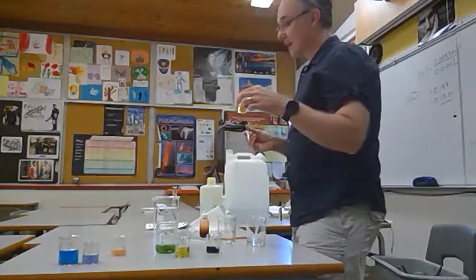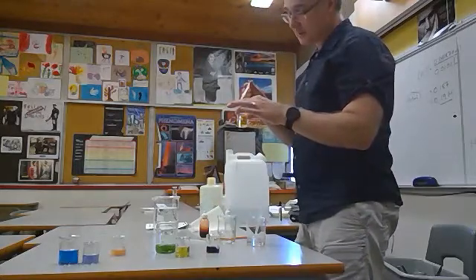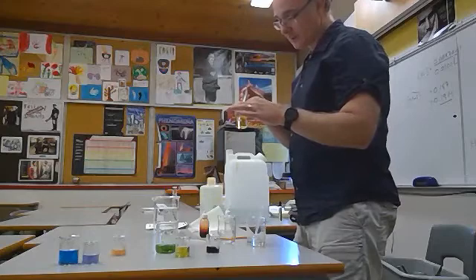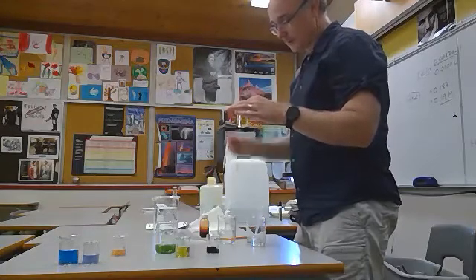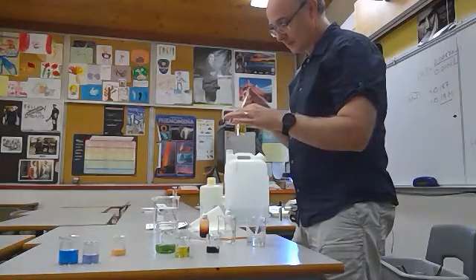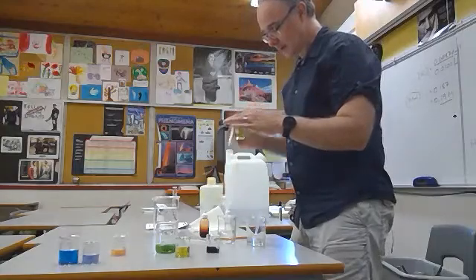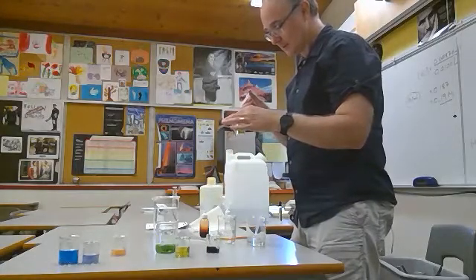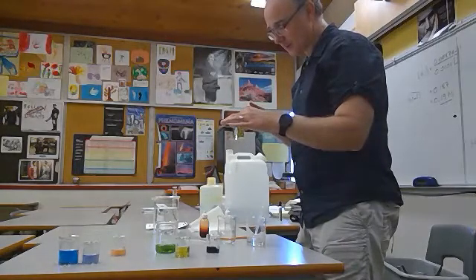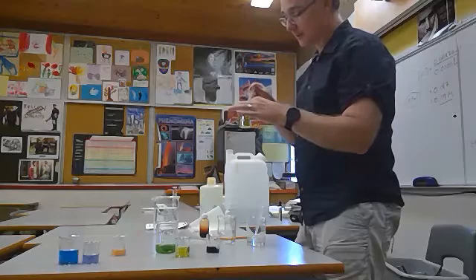And that's because I added so much acid to it. So I'm going to add base to it now to show that you can actually shift the buffer back to its sort of happy place. Not sure how much acid I added to this thing. It's definitely going more yellow. I added a lot of the acid and base are different concentrations here. So if I give that time, it's going to become more green. But notice it's not going purple as quickly. Like I'm adding huge amounts of chemical here.